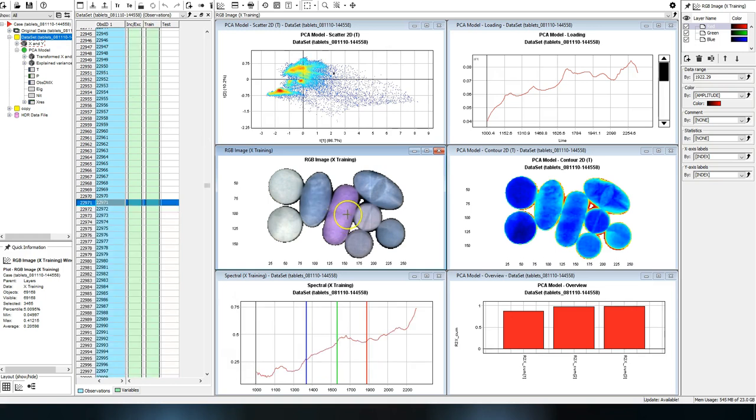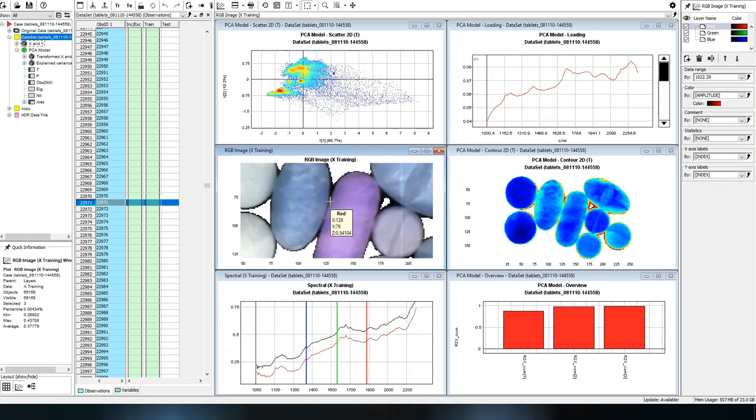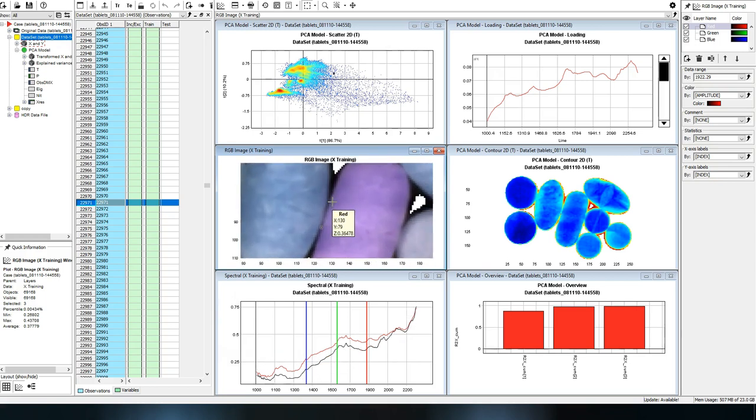If you want to magnify an area of a plot or image, simply use the scroll wheel on your mouse to look closer.